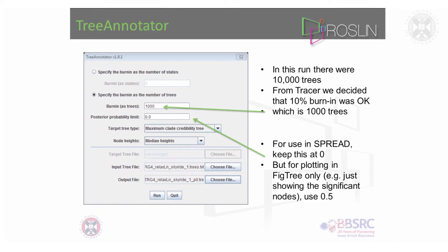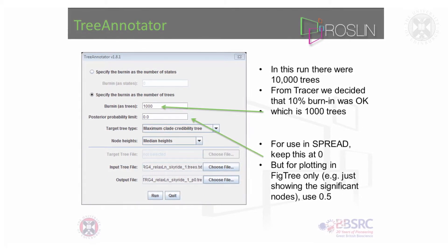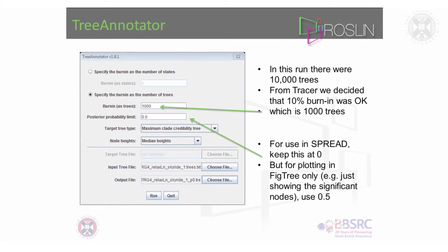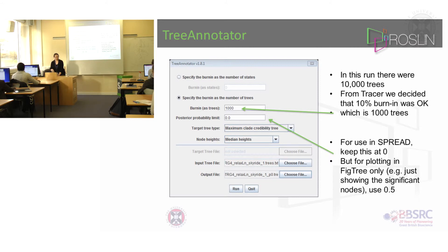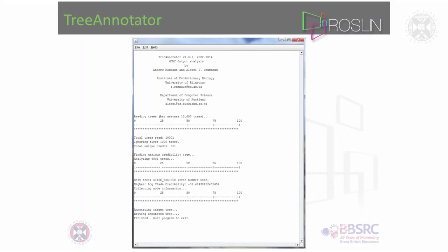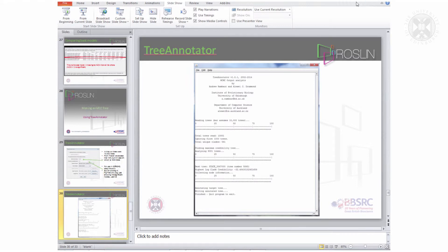To make an MCC tree in Tree Annotator — it's in the same directory as BEAST — when you first open it, it will ask you to specify the burn-in. Click 'specify burn-in as number of trees' and we're going to ignore the first 1,000 trees. Each of my files ran for 10,000, so ignoring the first 10% means 1,000 trees. Leave the posterior probability limit set to zero. Choose the input file — a .trees file — then specify an output file name, usually the same name but with the extension changed to .tre. Click run and it will process.